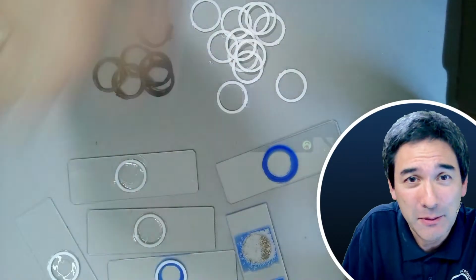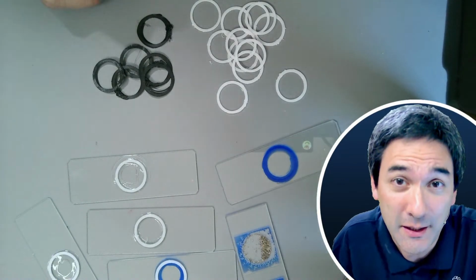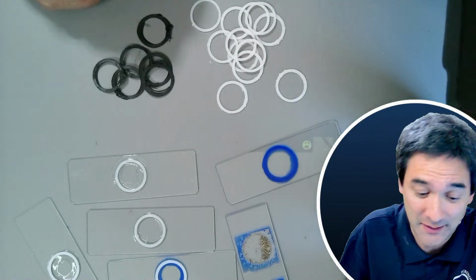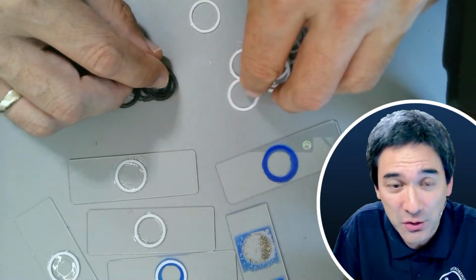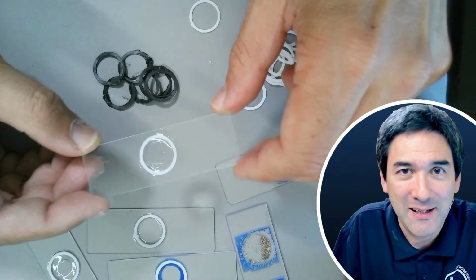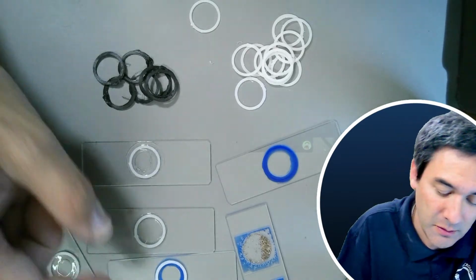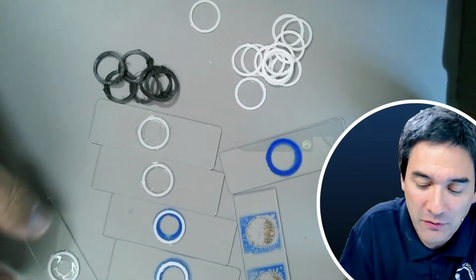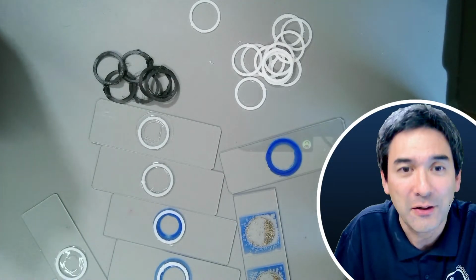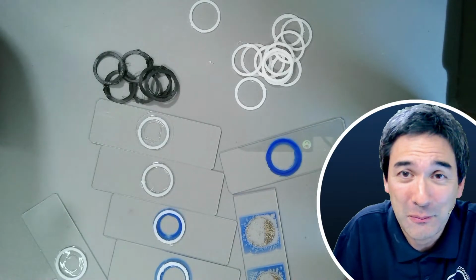You might be wondering a little bit what I got here on my desk. Today I want to try to make a few microscope slides for sand. So what I've got here are some spacer rings. I've got already some not so nice looking slides prepared here, and I would like to experiment a little bit with those. First trials do not always look very nice, but in any case I would like to prepare a couple of slides here. I do have a few interesting sand samples with me, and we'll of course also put them under the microscope.